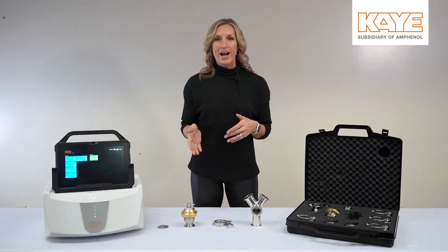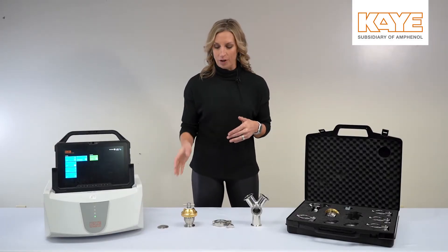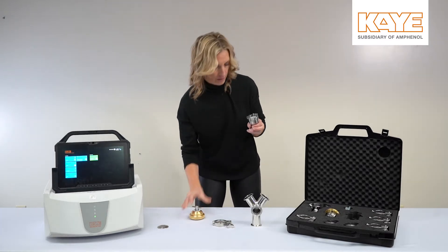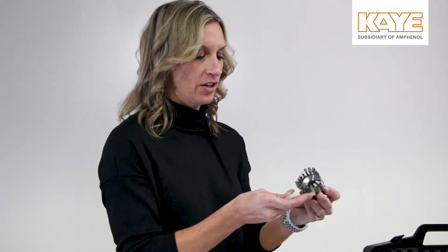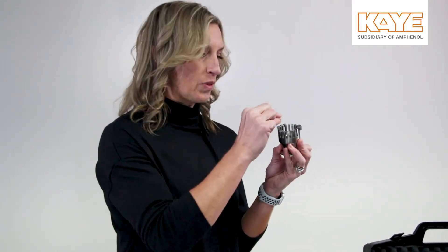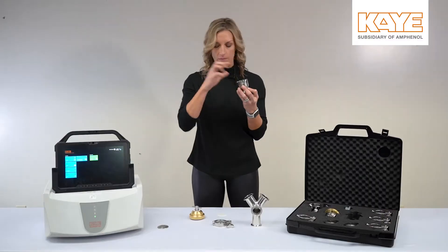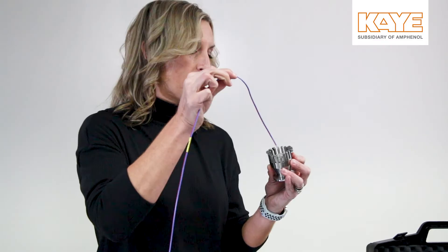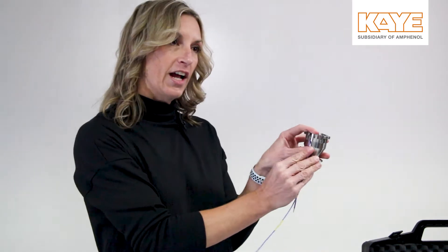Now I'm going to show you how easy it is to use the feed-through. First, you would hit the lock and remove the cap. There are two gaskets inside — you would take those out, place the one with the hole in, then grab your thermocouple and place it in the center.